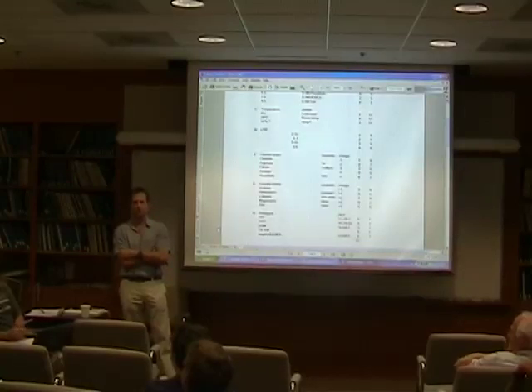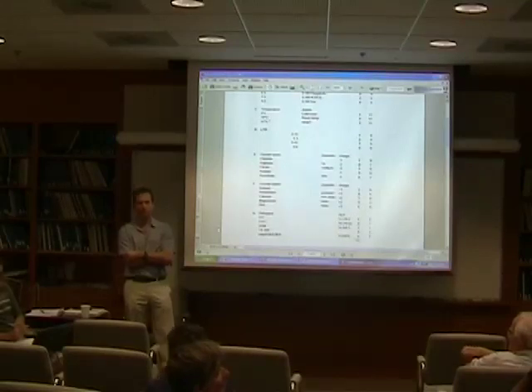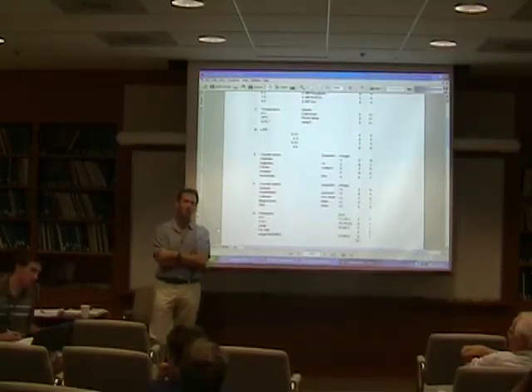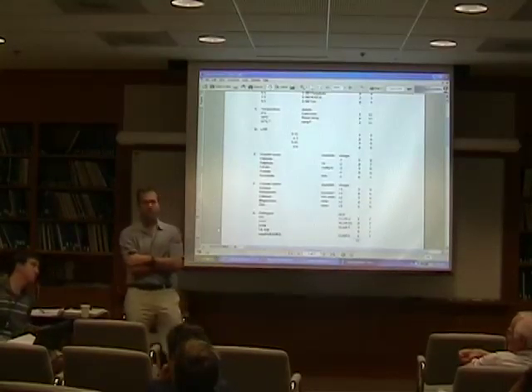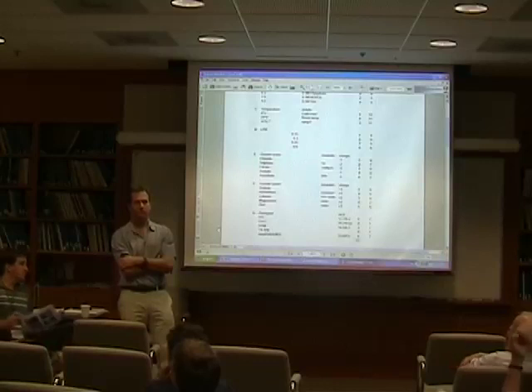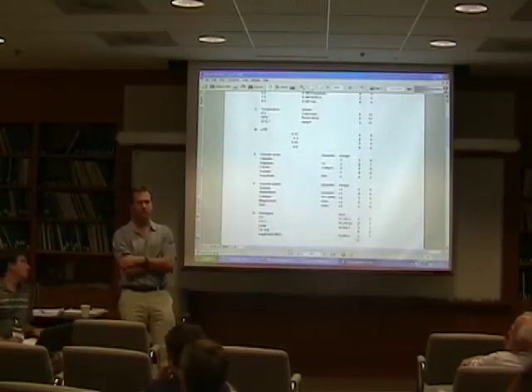But then this means that you would have to do every screen several times. Every time you check any parameter, you should do it several times before you make a conclusion from it. Yeah, but you said that different protein purifications are different. So how do you know that the negative result you get the second time depends on your protein purification or on the screen?